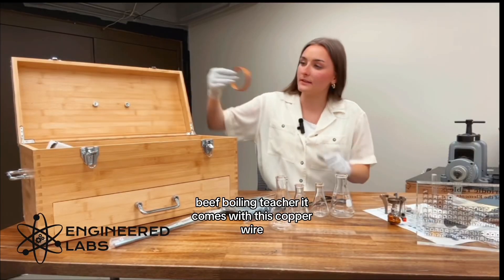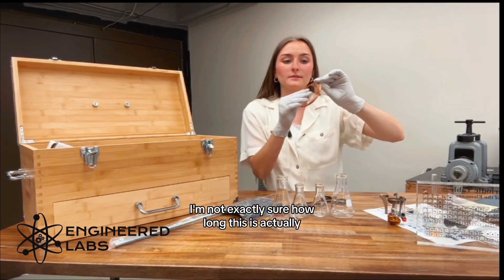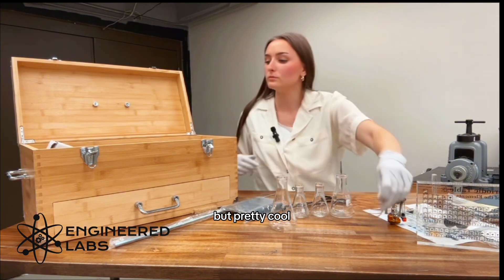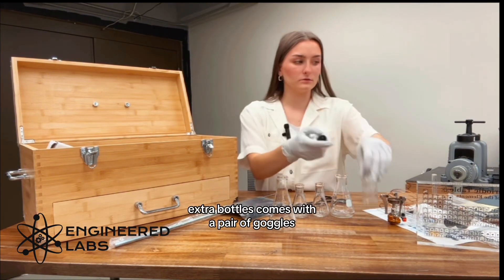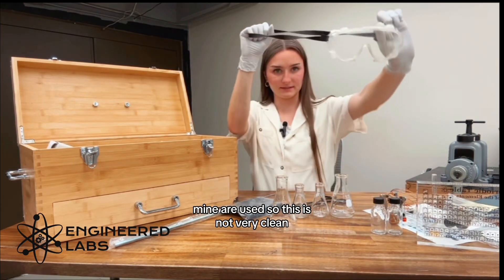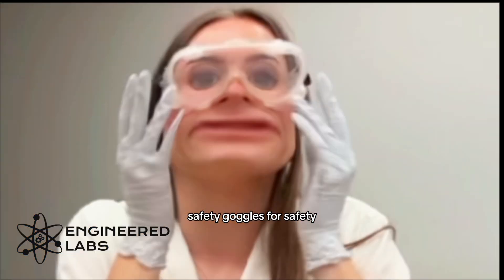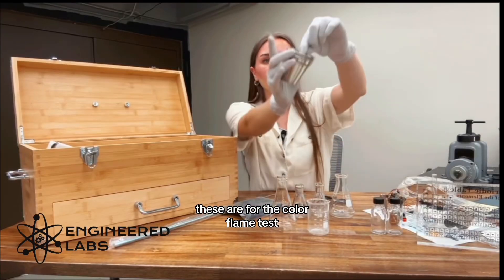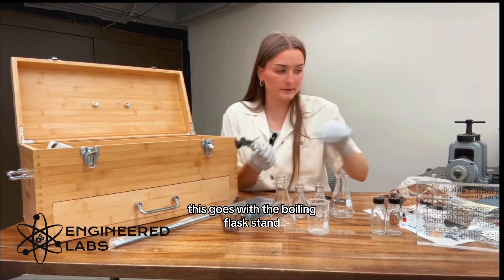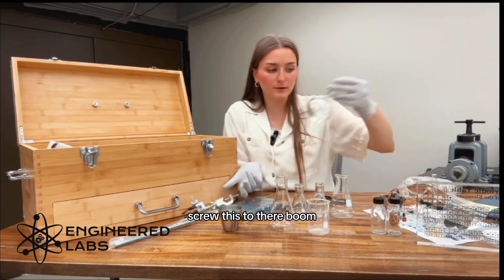Comes with clamps so that you can touch things that are hot, like your boiling beaker. It comes with this copper wire — I'm not exactly sure how long this is, but pretty cool. Extra bottles. Comes with a pair of goggles — mine are used so they're not very clean. Safety goggles, for safety. These are for the color flame tests. This goes with the boiling flask stand — clip your little flask to there, screw this to there, boom.